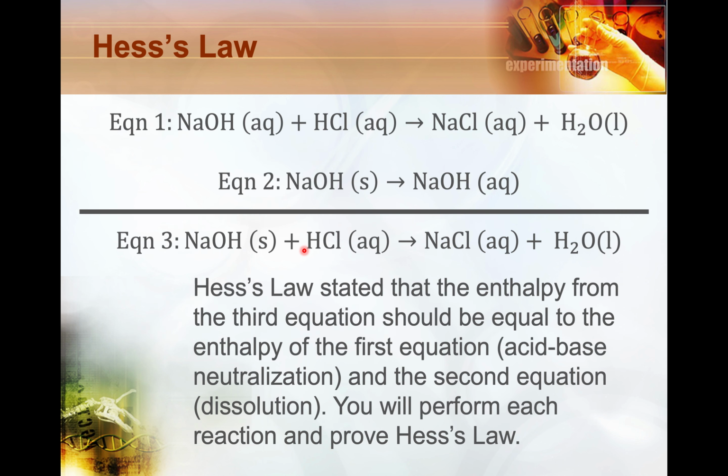So this is what we're going to be doing today: we're going to be considering the fact that Hess's law says that the enthalpy of the third equation should be the exact same as the enthalpy from the first equation plus the second equation. I'll keep calling this an equation, maybe even a reaction, but this is more accurately described as a process where we're dissolving the sodium hydroxide.